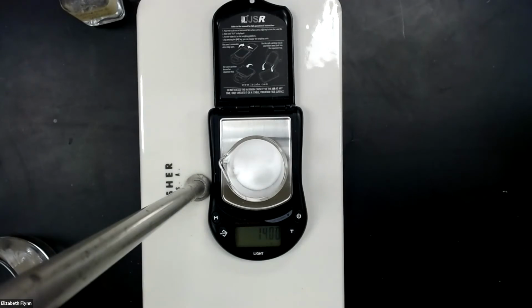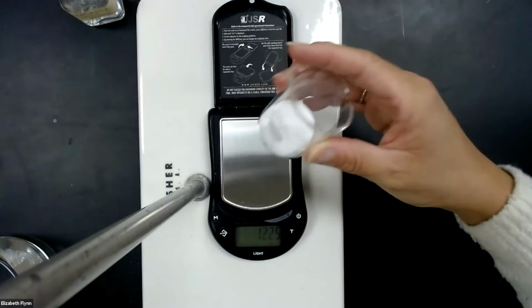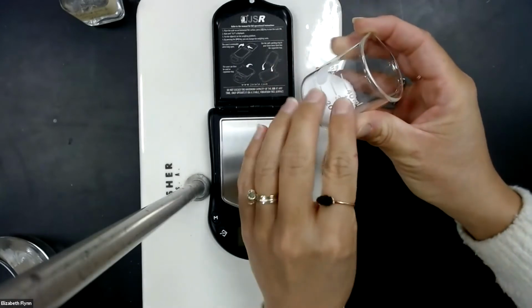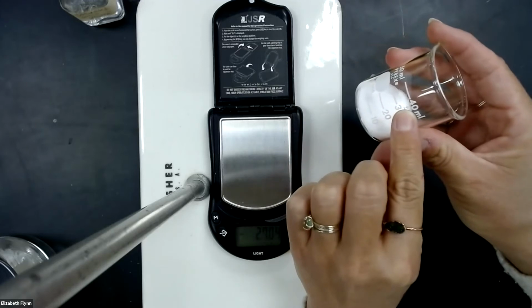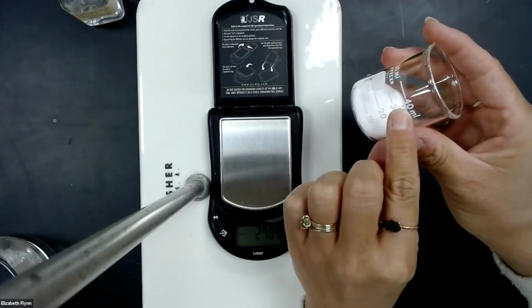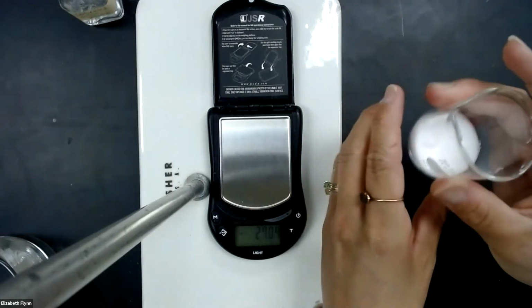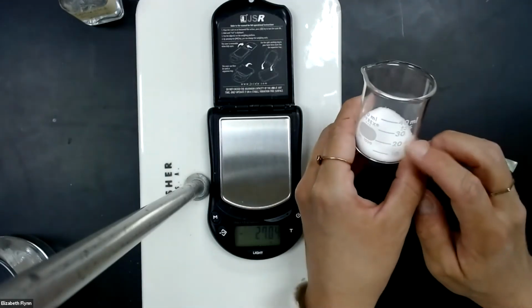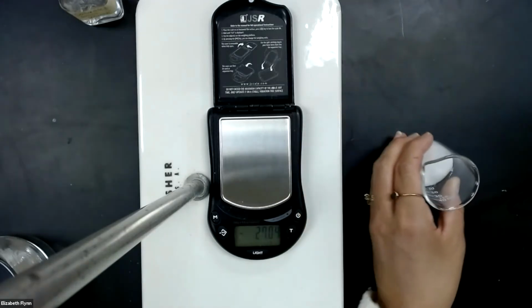And now we're going to add 40.0 milliliters of water. So what am I going to do? Am I going to just fill up this beaker to the 40 ml mark? What do we think? No. Oh, that wouldn't be adding 40 mils of water. That would just be making the whole solution have a total volume of 40 mils of water, right? And it wouldn't be 40.0.